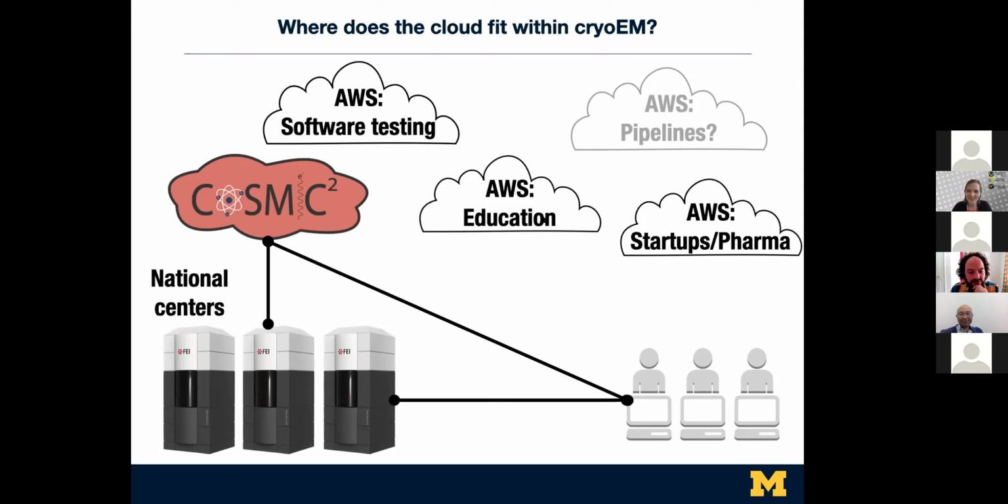That's the example of the conversations we're having, to figure out whether we want movies shipped straight to us. Our thinking has been that you will typically have micrographs, because you probably, hopefully, did your motion correction close to when you collected data, but that might not be the case.